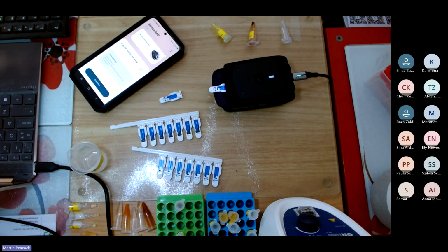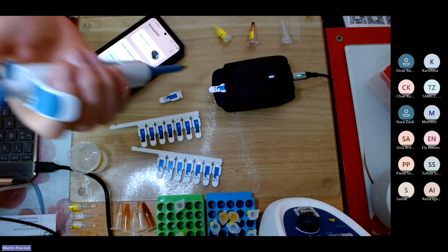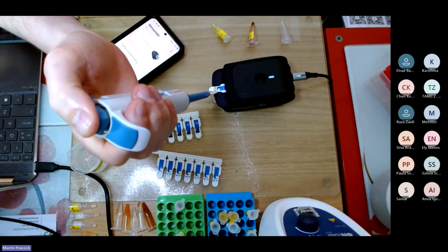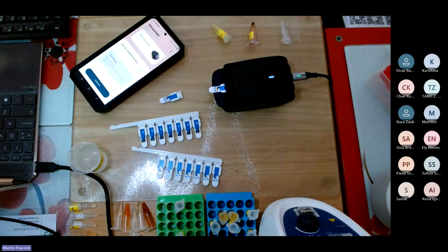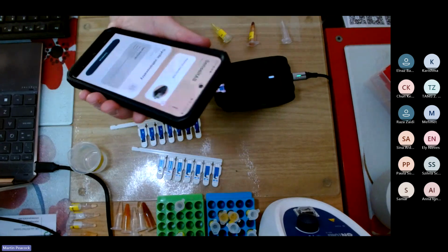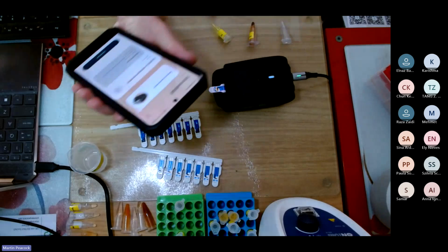Lots of people like glassy carbon electrodes. The first thing you do when you pick up a glassy carbon electrode is you actually clean it. So when we compare screen printed electrodes to glassy carbon electrodes, we're not being fair, because you cleaned that glassy carbon electrode just before you used it.